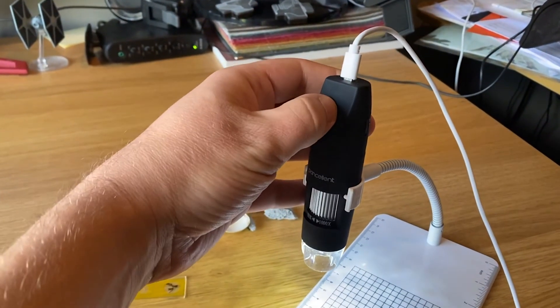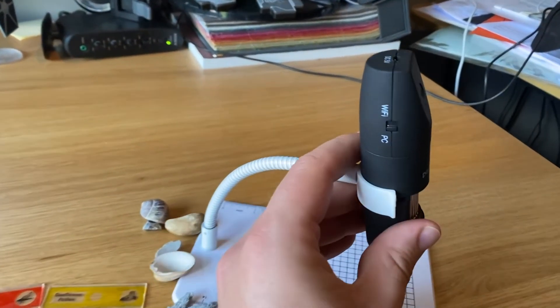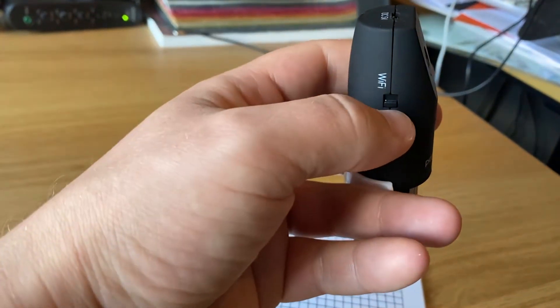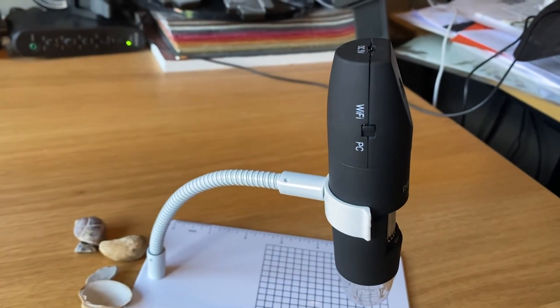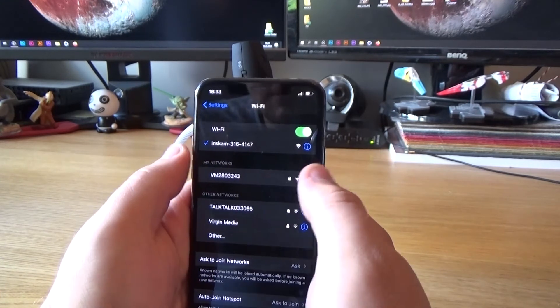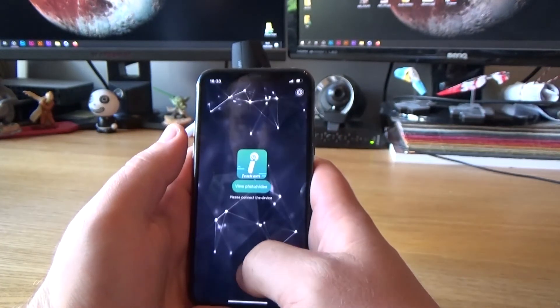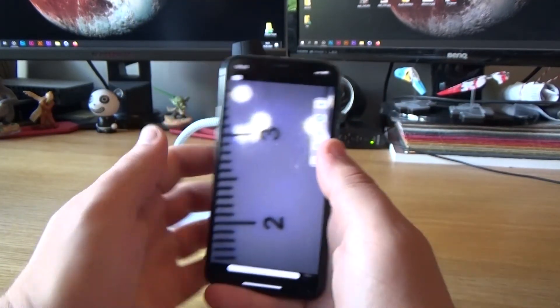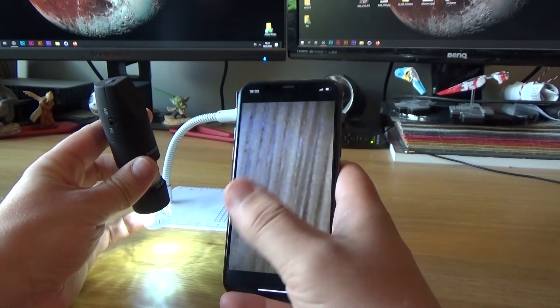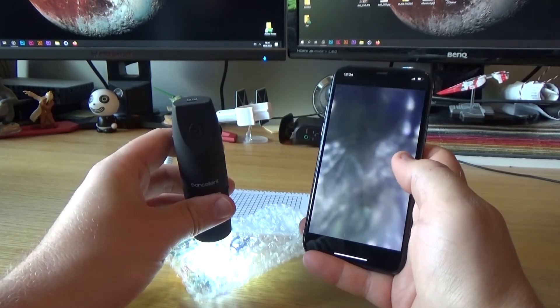Now let's look at the Wi-Fi function. You switch it off by holding the button on top, remove the cable disconnected from the PC, and switch the little button to Wi-Fi. You do not need a Wi-Fi hotspot or a router in your home. All you have to do is bring up your phone, activate your Wi-Fi, and the microscope will pop up as a Wi-Fi spot — you connect to it fairly easily. You can't be online with Wi-Fi and connect to it at the same time. They give you software, you log in, and you're seeing live footage from your camera. There's no router needed — all you need is your phone and this microscope. Take it with you on a hike and you can record footage and explore objects on the go.